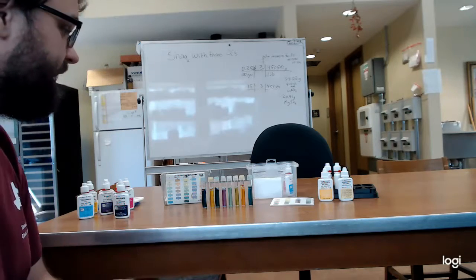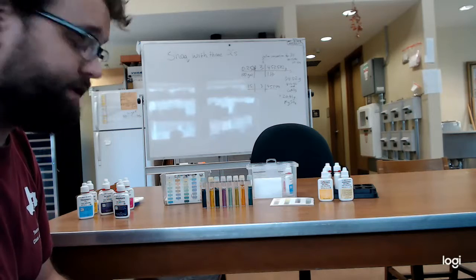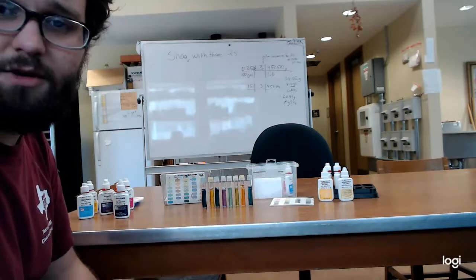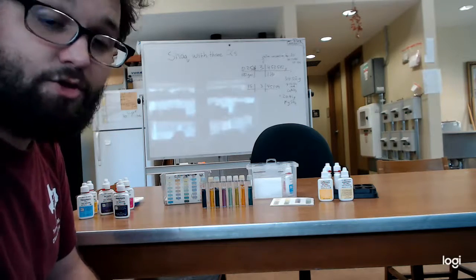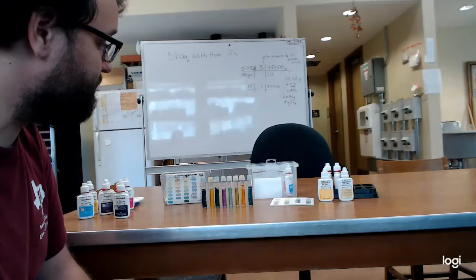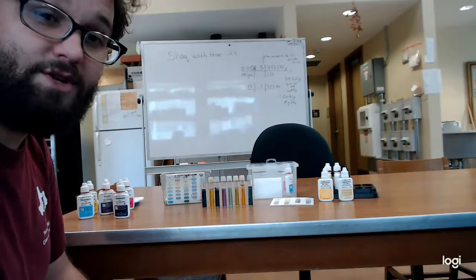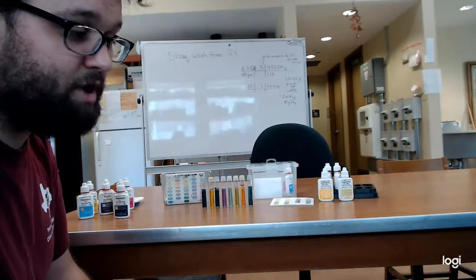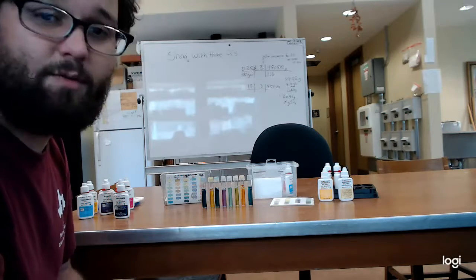Well guys, that I believe concludes our titration. I had a lot of fun doing it. I hope you guys learned quite a bit. Again, this is something very easy, something you could do in your own backyard. You can test your own compost tea, you can test your own nutrient solutions. They're a really fun little kit, and they're pretty easy to interpret. They don't have a super wide range of numbers on them, so you may get off the chart sometimes, but that is just kind of a part of being a soil scientist and dealing with nutrient analysis.